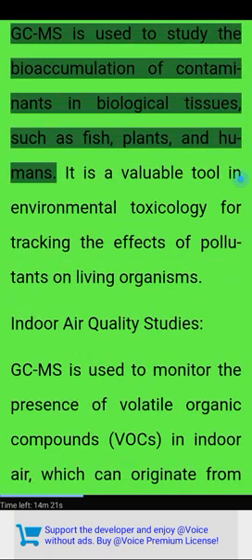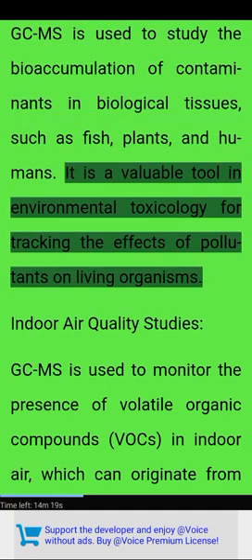Biomonitoring and toxicology. GCMS is used to study the bioaccumulation of contaminants in biological tissues, such as fish, plants, and humans. It is a valuable tool in environmental toxicology for tracking the effects of pollutants on living organisms.